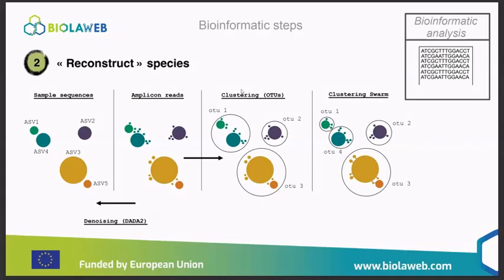That's why we developed other ways to cluster that do not use one identity threshold. For this clustering, you don't give the algorithm a threshold. It decides itself depending on the sequences. It's automatically done by the algorithm. And that's also why denoising is very interesting: you don't choose, it's not dependent on the person, and the algorithm does it by itself. Thank you.